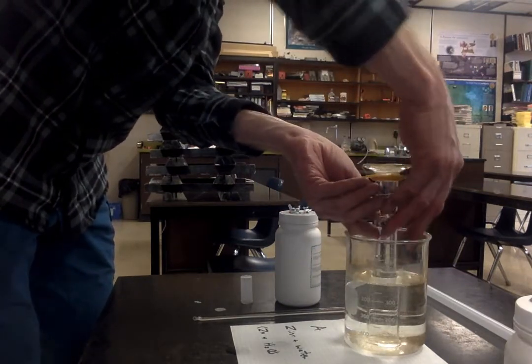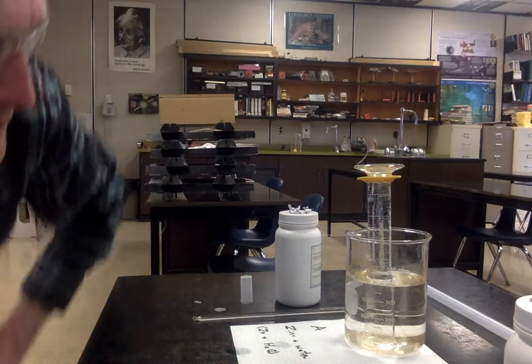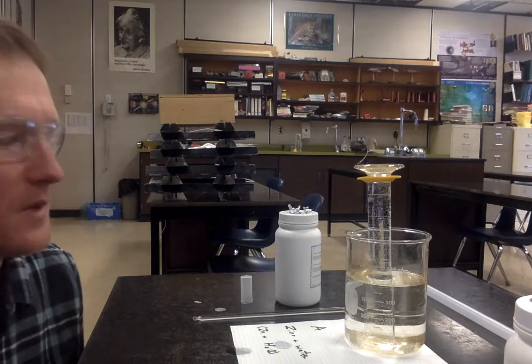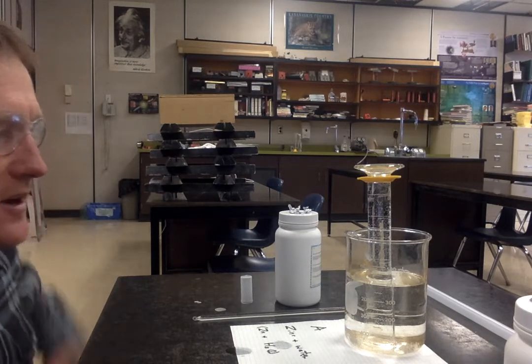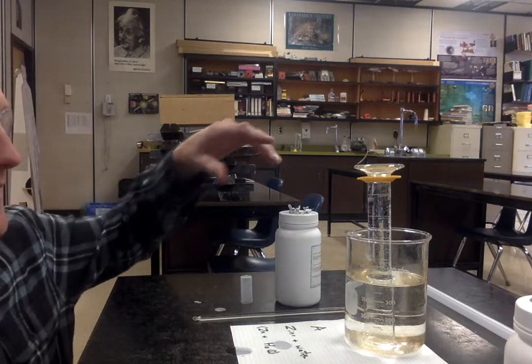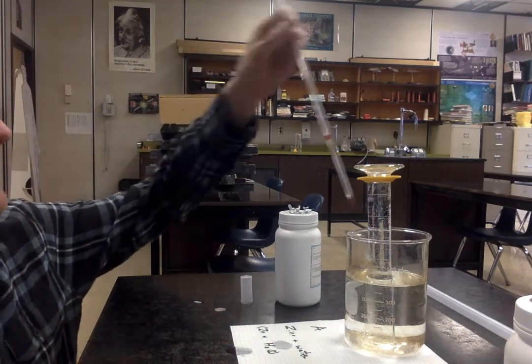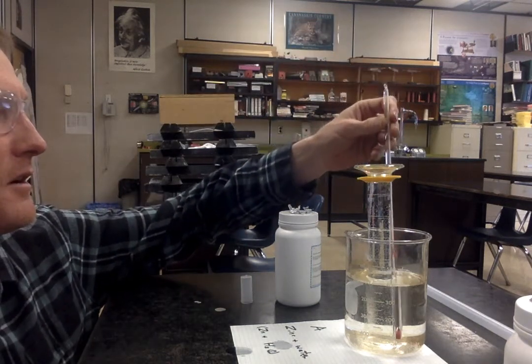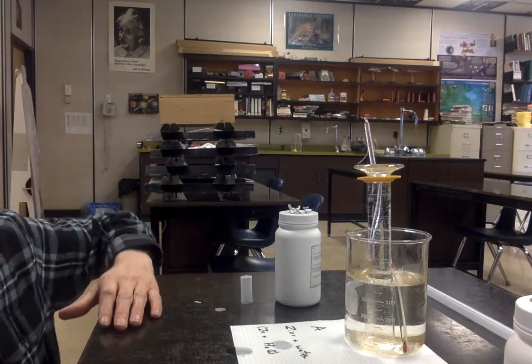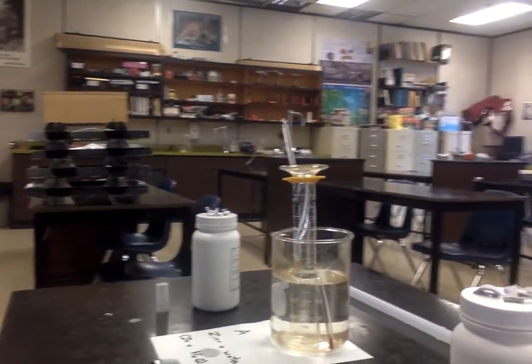Okay, not perfect, but not bad. I flipped the graduated cylinder, so there's a continuous column of water right here inside the beaker. Also notice, I haven't put the zinc in yet, so there's no reaction. But let's not forget temperature. I'm going to put the thermometer in.